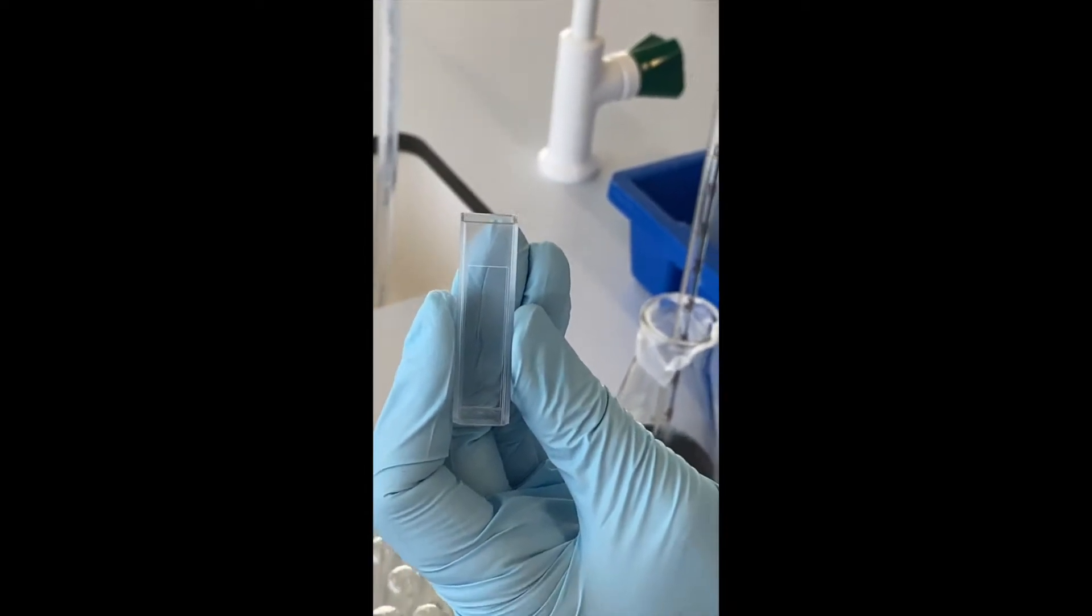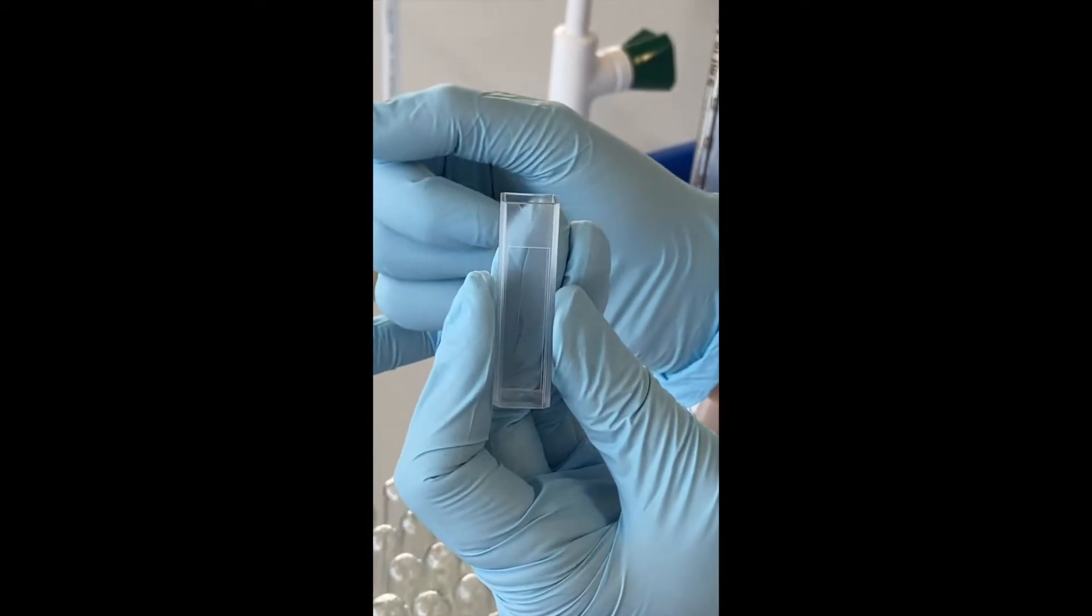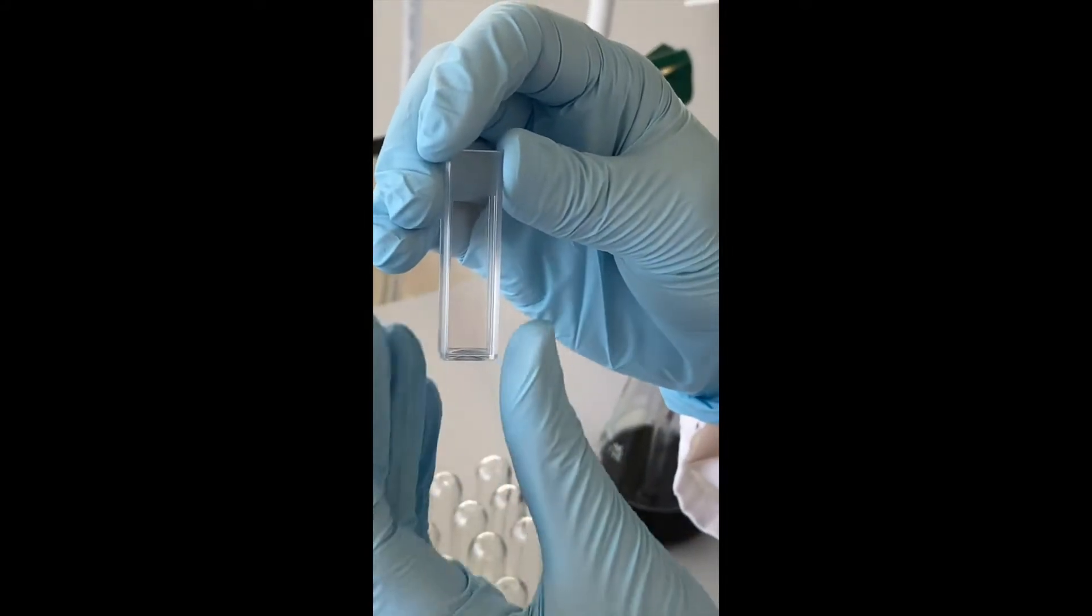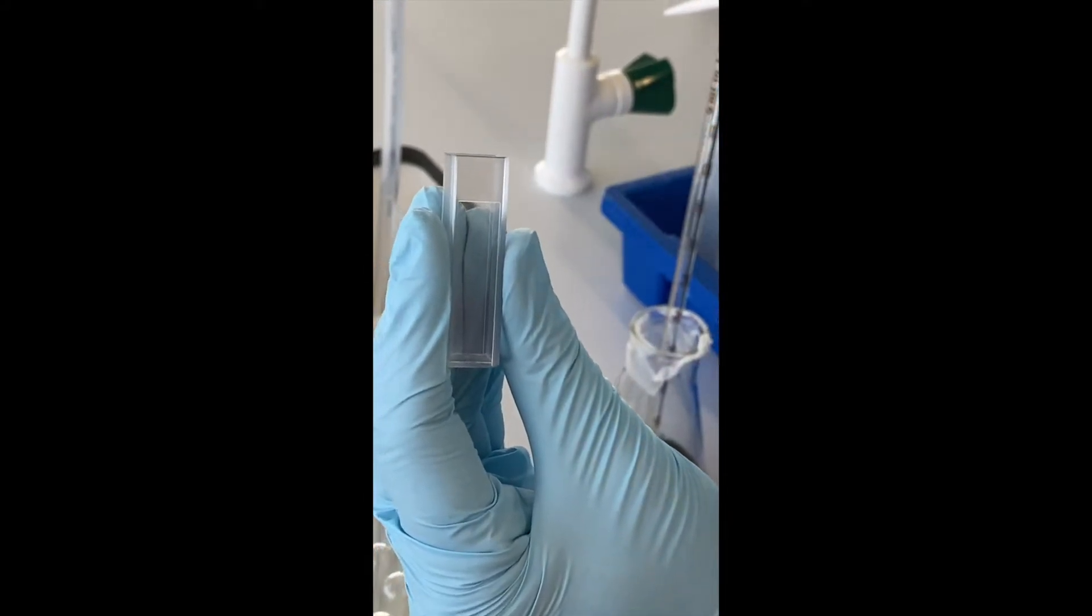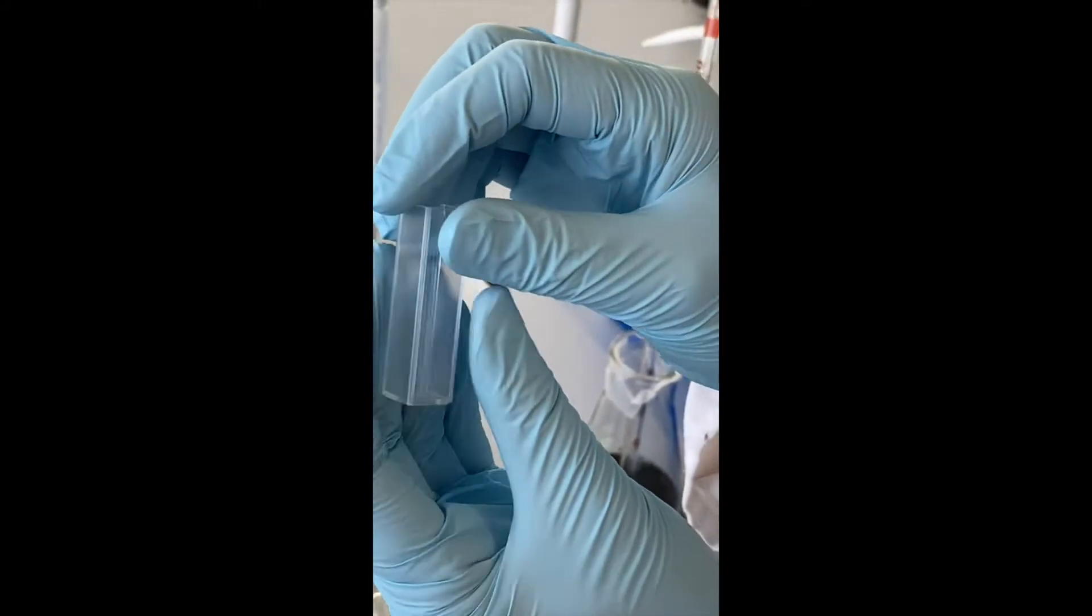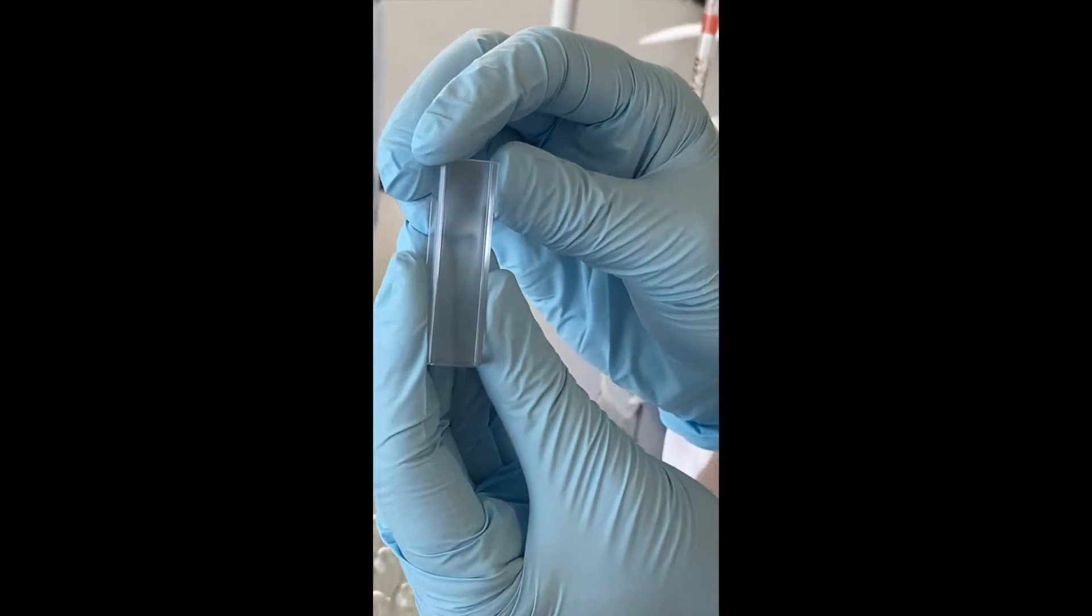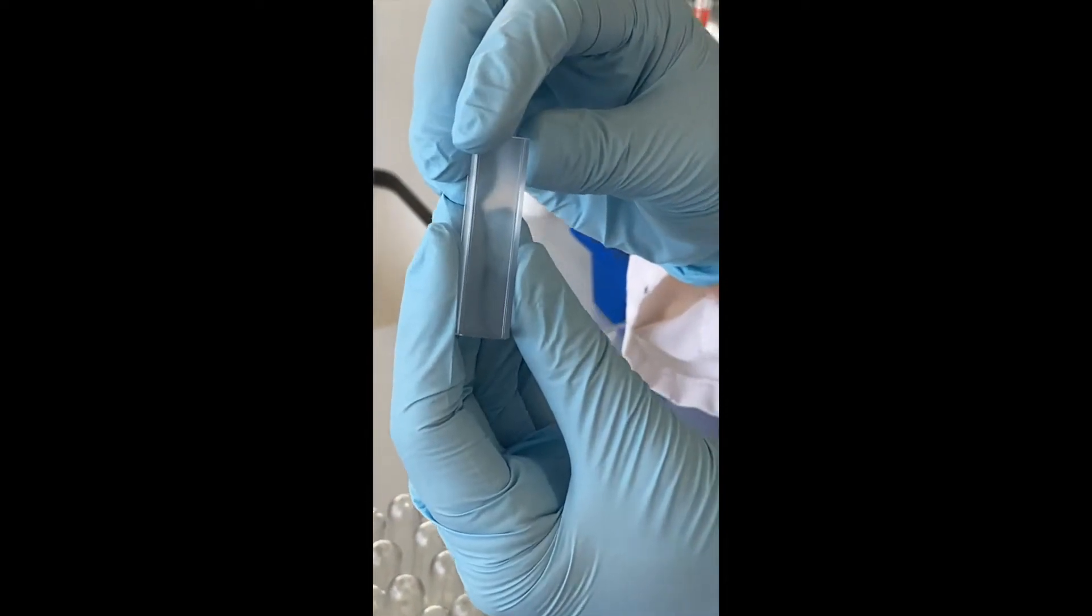The next thing to check is which direction you want to put this cuvette into your spectrophotometer. This end with the triangle on has a clear face on it. This wants to face in the direction of the light. The other end is clouded. That one does not because you will get no readings.